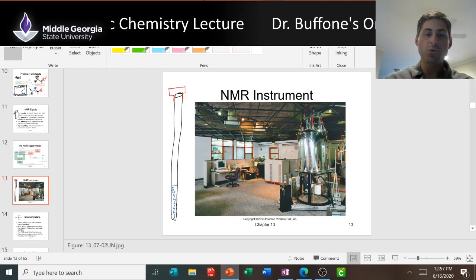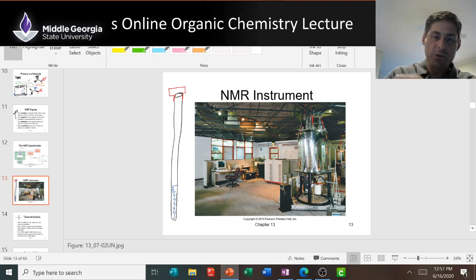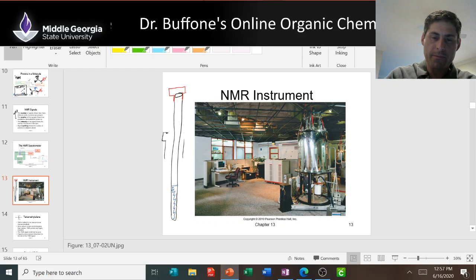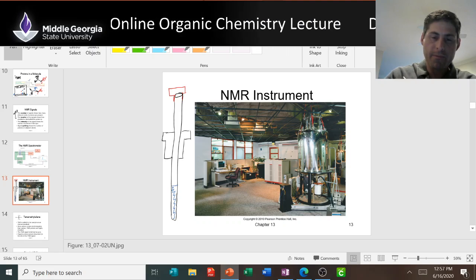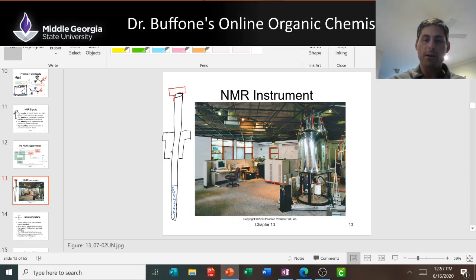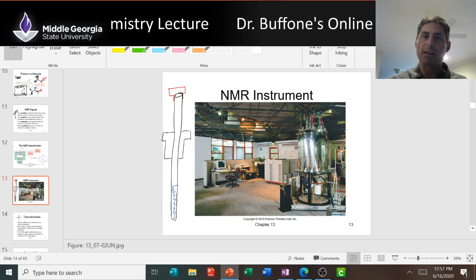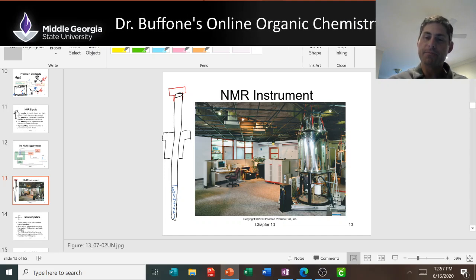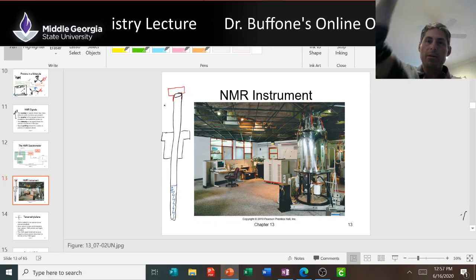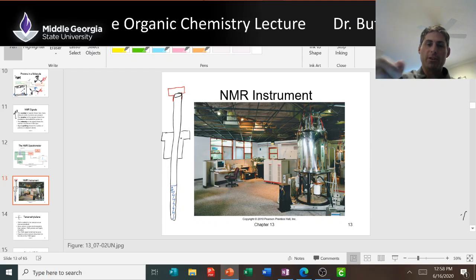Right, like that. You take this glass tube that's capped with compound in NMR solvent, and then you put like a little spinner. The spinner is just a little weird looking thing as well. You take your tube and insert it into a spinner, and then you go to the computer, you press a button that shoots air through a small tube that runs through the center of this instrument. You walk up the ladder here. The air is flowing out of the tube. You place this setup in the hole at the very top. The air allows that tube with spinner to kind of float.